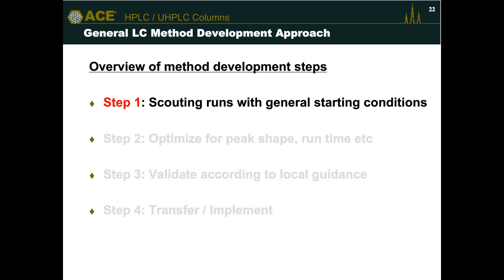Then there's step 2 where we optimize the chromatography. We then validate depending on the industry you're in, and then we begin the sample analysis, or we transfer the method elsewhere in step 4.